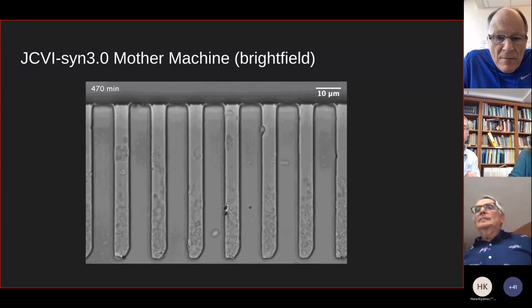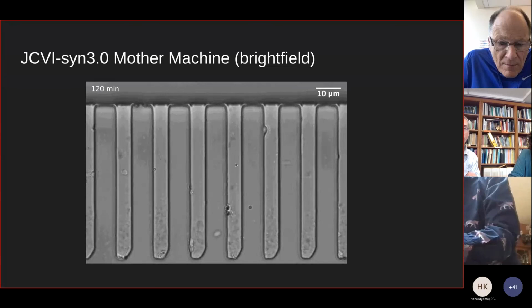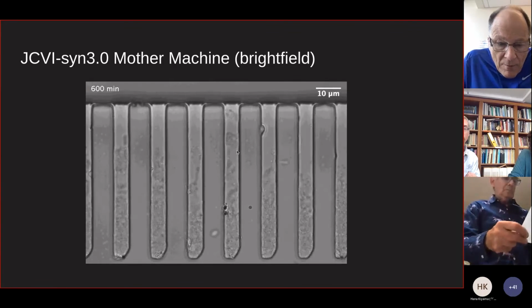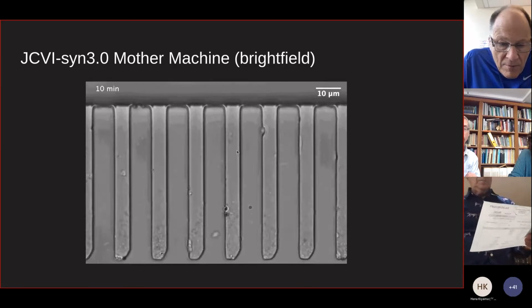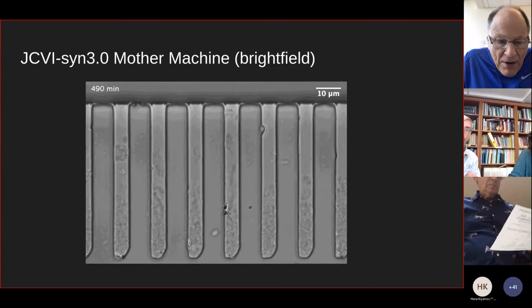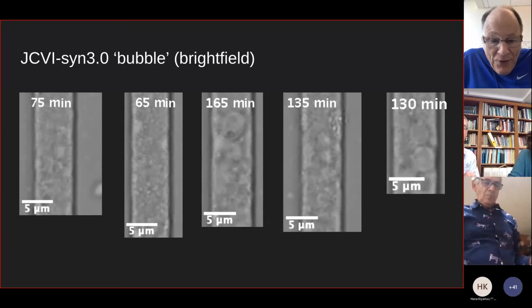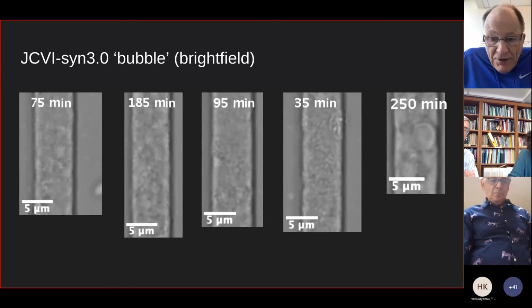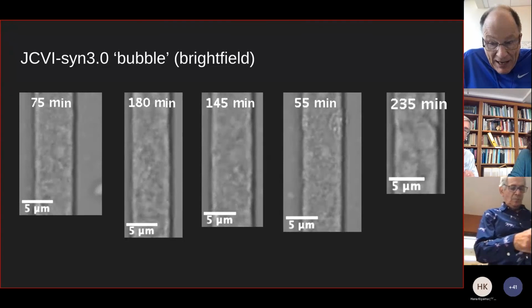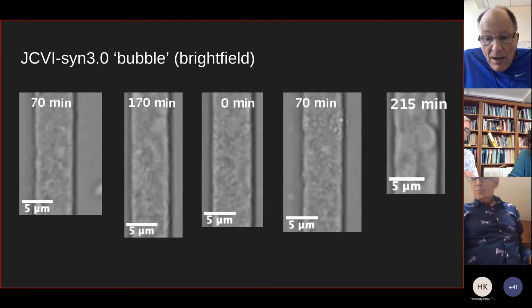Yeah, I think the experiment I'm probably most excited to run is putting the Syn3.0 in some kind of seriously confined channel, like maybe 500 nanometers or a little wider, but I haven't had a chance to do that one yet. And then the bubbles that you talk about, I think, and I think James will agree with this, that these are vesicles that the cells make. Mostly they do not have cytoplasm in them, but sometimes they do, and sometimes they have DNA in them.